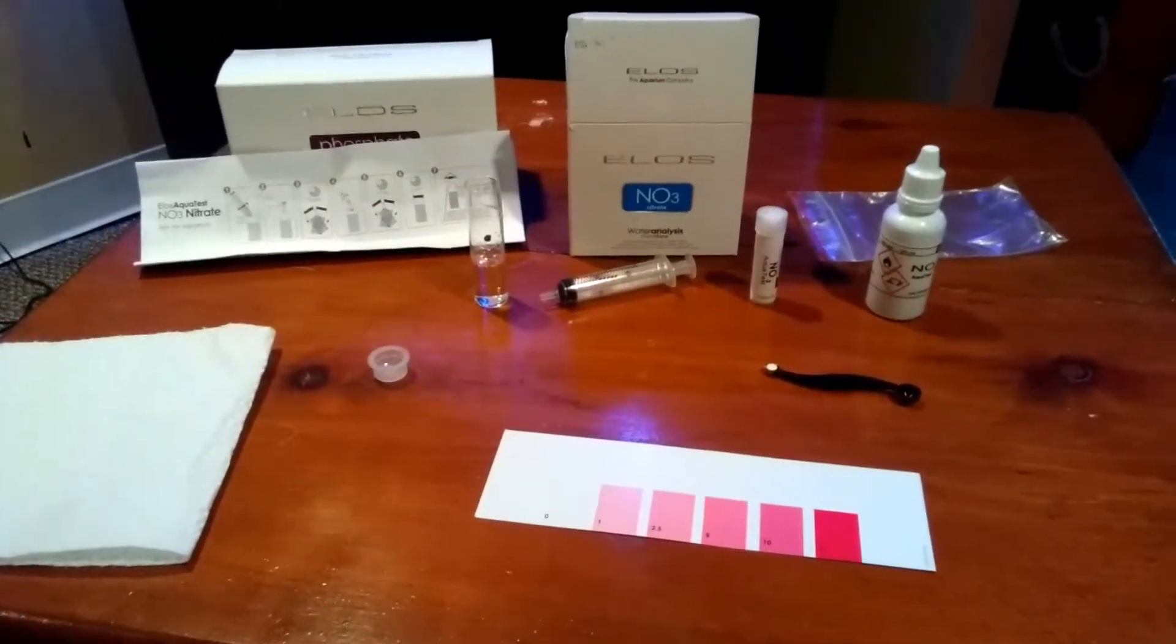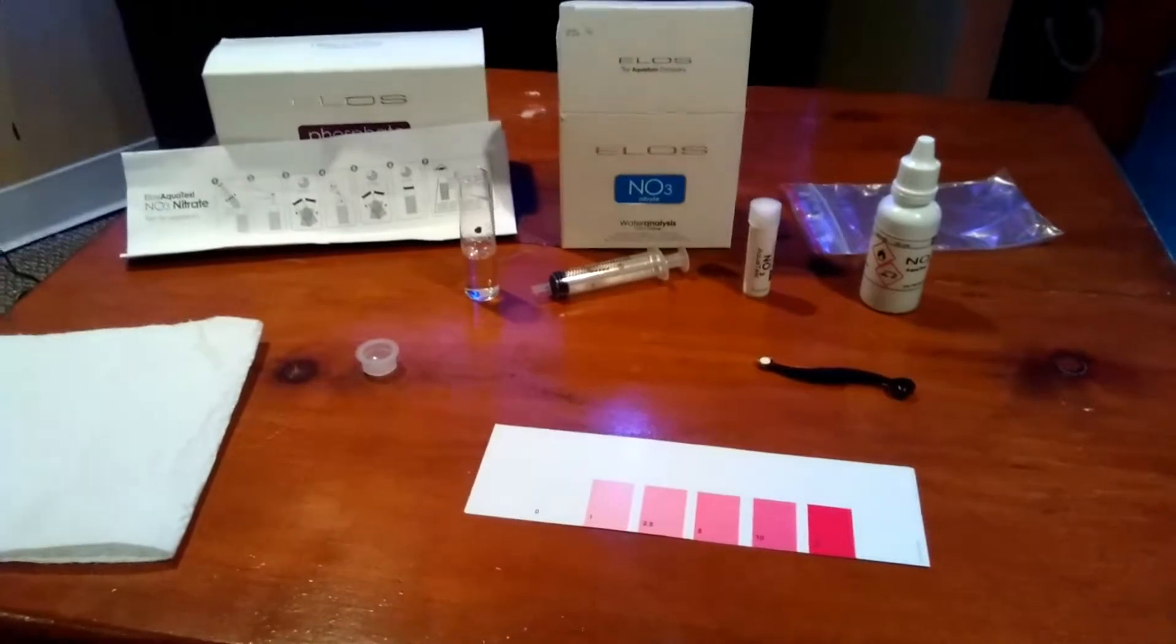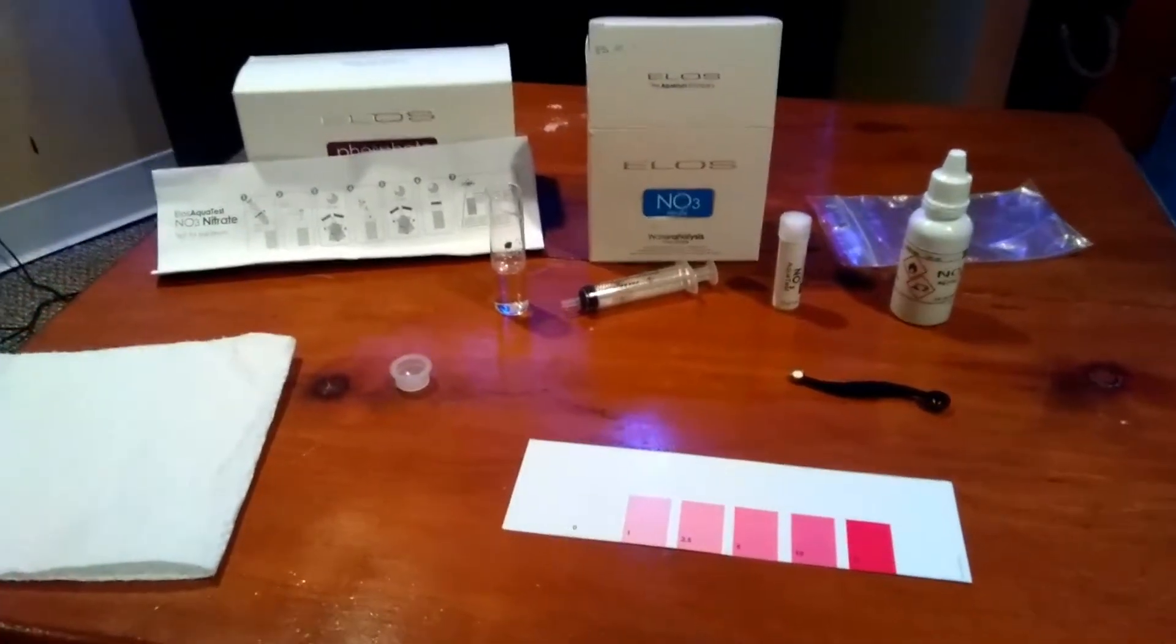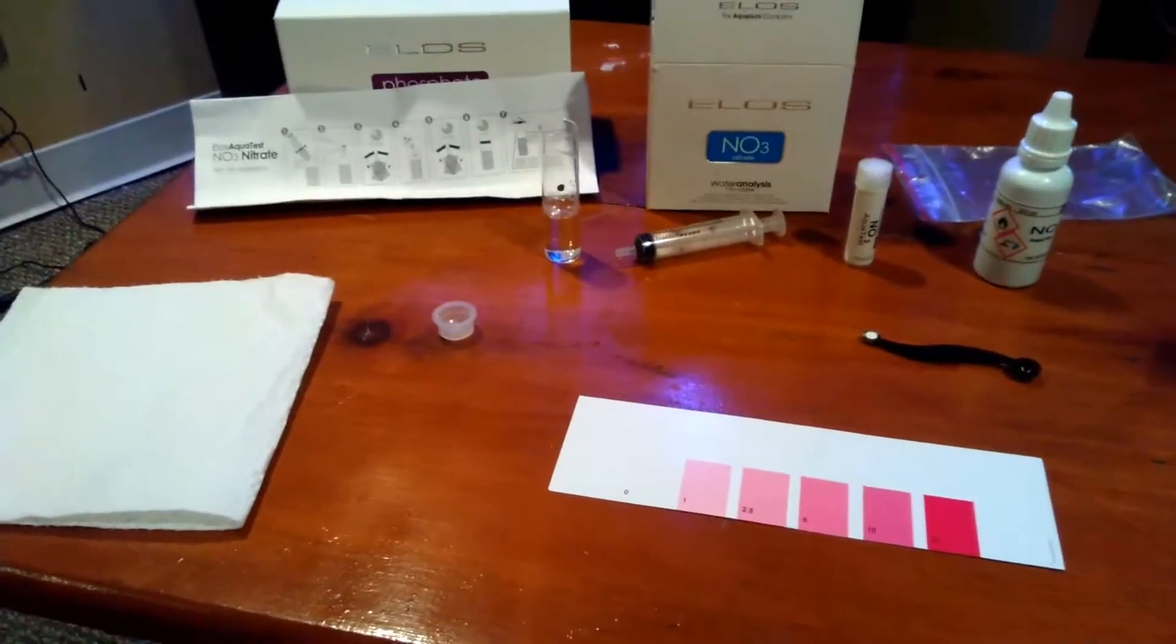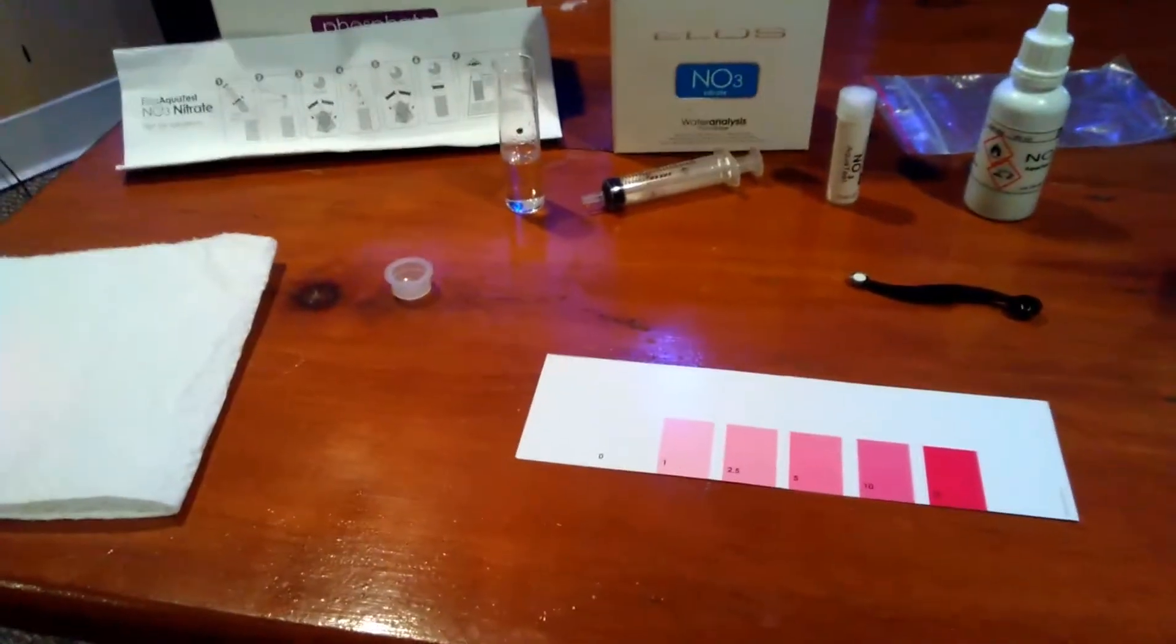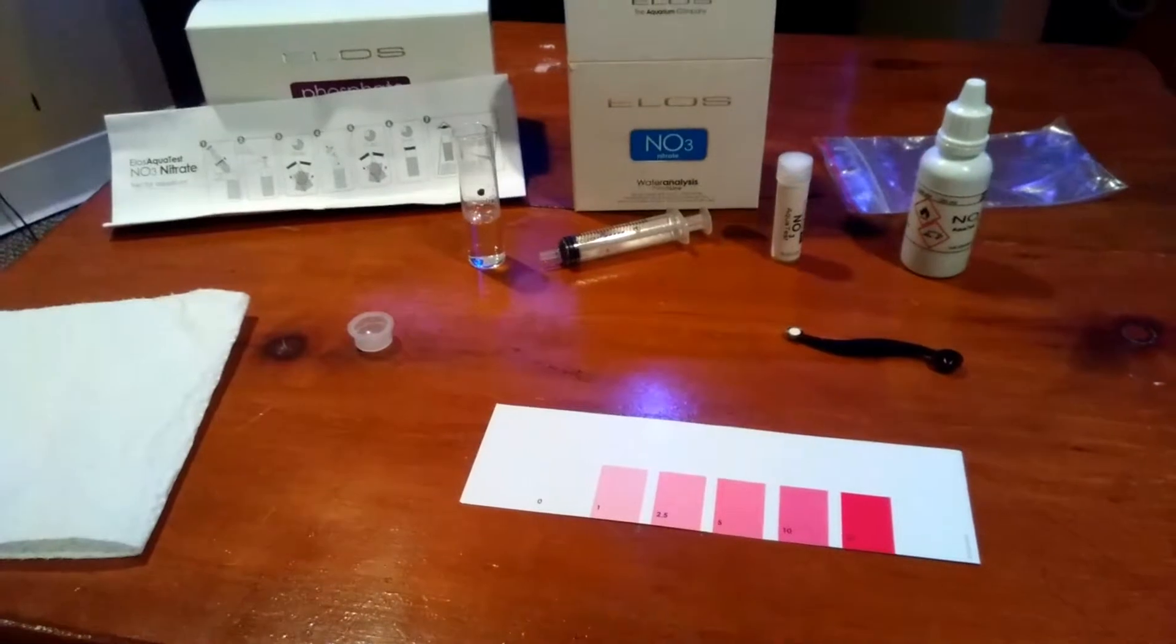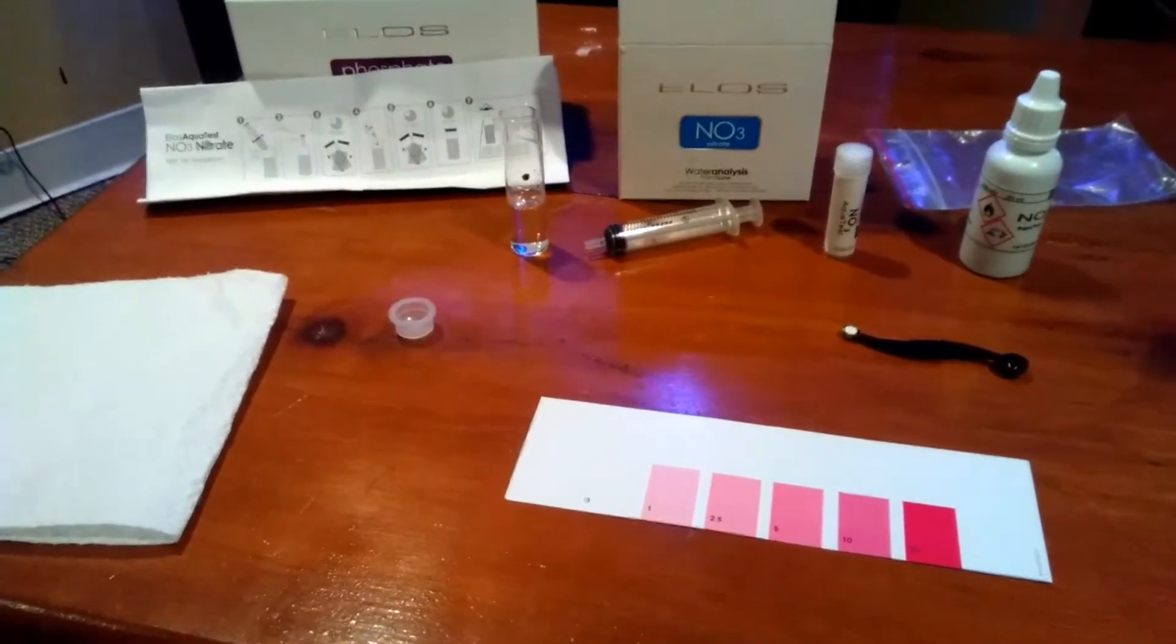What's going on everybody? It's 40 Beat Nasty. I'm here to show you the Elos Nitrate Test Kit. It's very simple to use and actually got a great color code chart for when you're testing. I did this the other day with my saltwater tank. Now I'm going to be doing it with my brackish water tank.